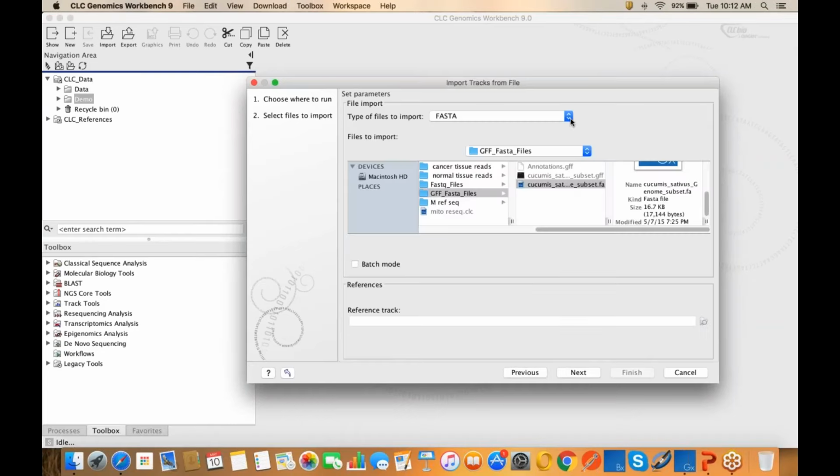And now to import annotation tracks, any standard GFF, GVF, GTF files are supported, which is the usual file format for your annotations or gene models, for example, and that is supported. So I have a GFF file of my annotations, and I'm going to select that.